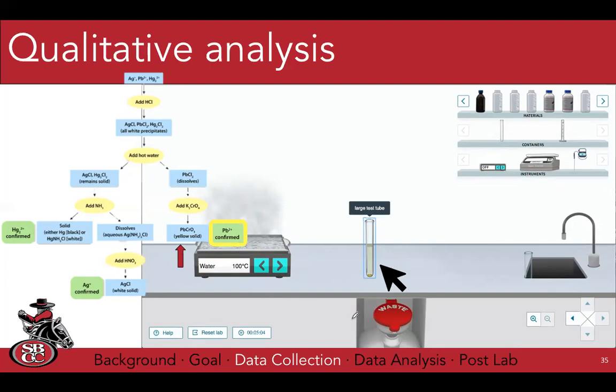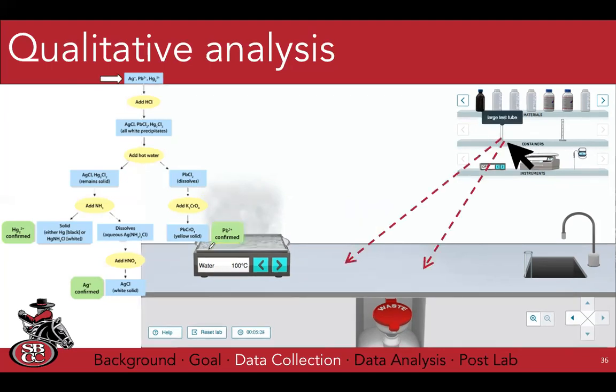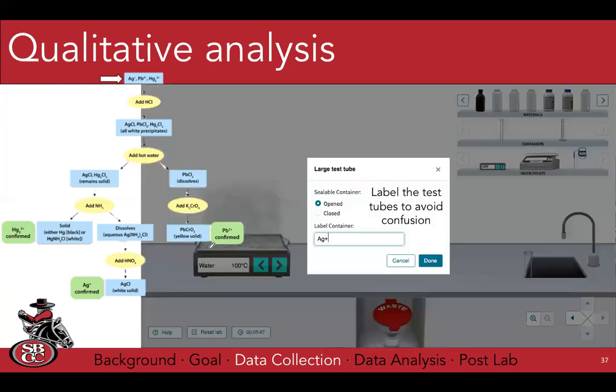Take whatever observations and notes make sense to you, because once you're doing the unknown, you're going to want to make sure that you're aware what each step means. So that's going to confirm lead. So now we'll do the other branch. We'll do 2 at once for brevity.